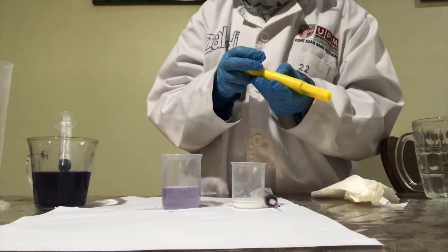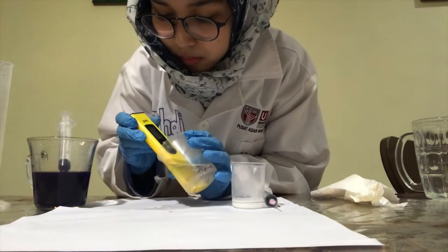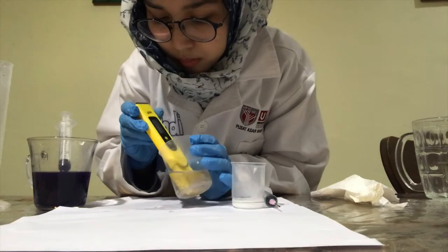After the addition of 20 ml of the titrant, the analyte reached pH 7 or the equivalent point.